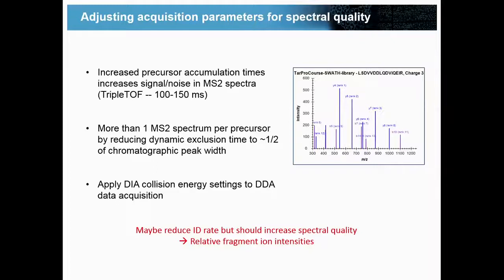Because then if you do the spectral library construction, everything is averaged, right? Everything is kind of put together to get the best spectra. I'll come to that in a little while. There are choices to be made there. You can do this kind of averaging, or you can pick the best one.